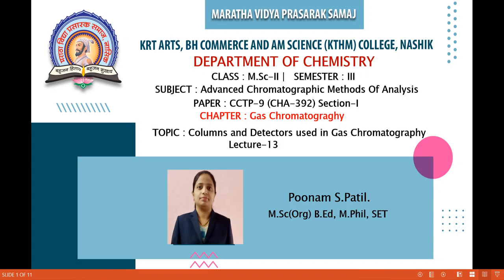In the previous lecture we started our third chapter, that is gas chromatography. In that chapter we discussed the components of gas chromatography. Out of 4 components we already discussed 2 components, that is carrier gas and sample injection. So these 2 components we have already discussed.